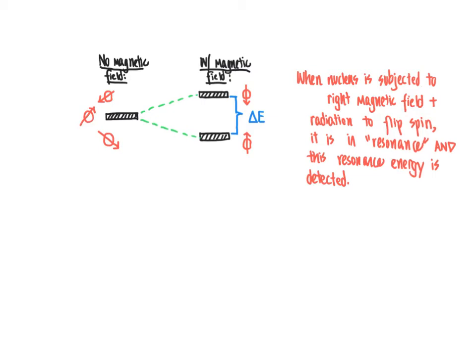Now, as we think about this concept of chemical shift, that is, where along the x-axis we are going to see signals for different protons from within a molecule, we need to go back and think about some of the fundamentals of NMR to consider how different protons have different chemical shifts. In other words, why do we see protons at different positions along the x-axis rather than all protons showing up at a single position along that x-axis?